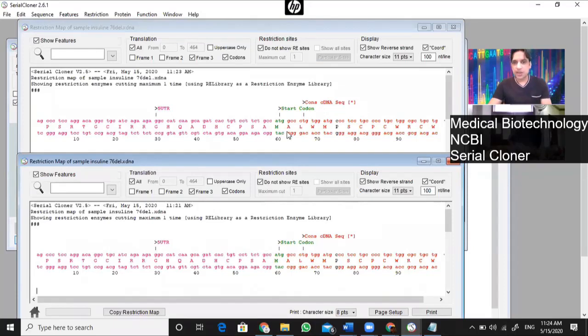Let's go for the first line. M is fine. M is here in the wild type. The above is the wild type sequence. M is here. Yes. M is here too. Yes. MAL. MAL. WM. WM. And then there is a P. Then there is a P here as well.